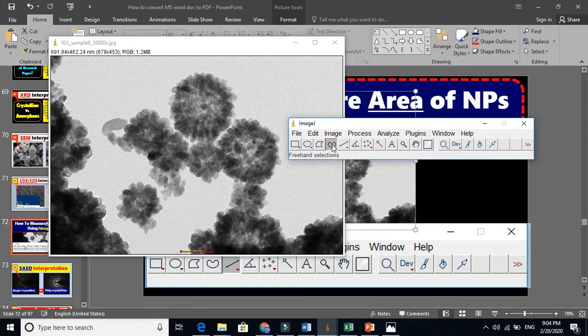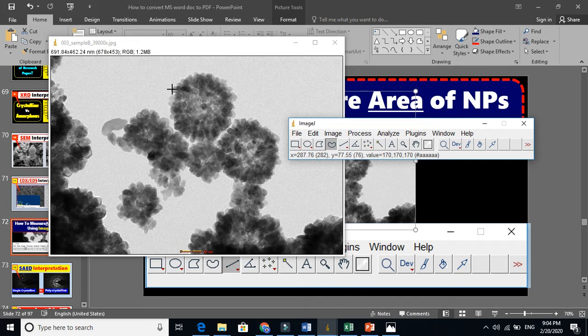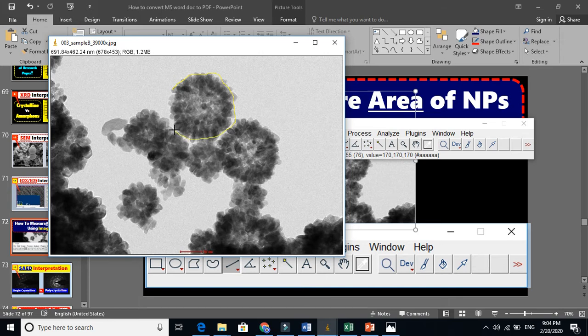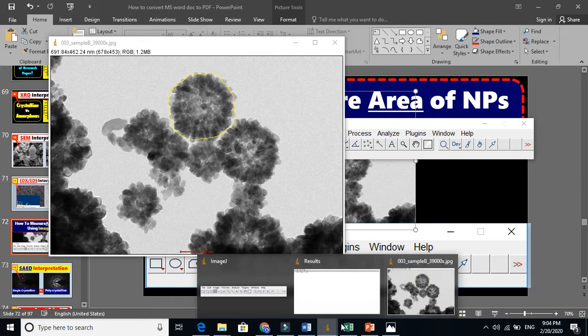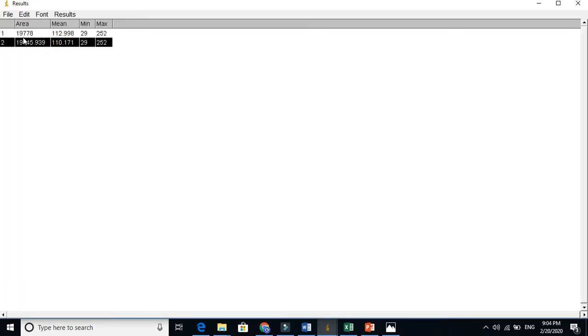Now let's take the shape. Don't press, just hold the mouse and draw like this. You can zoom the shape and do the measurement. Now press Ctrl+M and you will see the result. The area is 197545 nanometers squared.